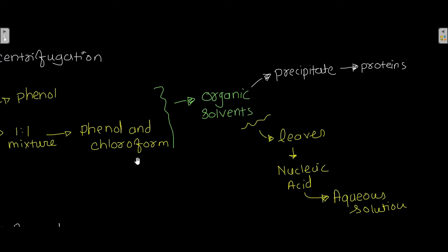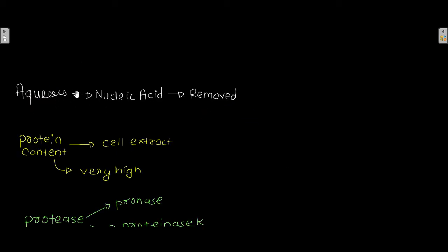So now your focus will be to remove the nucleic acid from this aqueous solution.